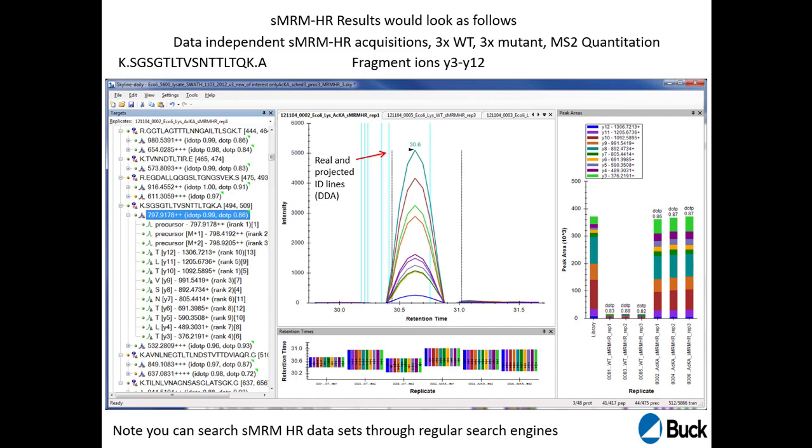It's really easy. It's incredible. Once you just have to install Skyline on the computer of the instrument. I don't know how this is at your place, but at our place we only have the acquisition software installed on the instrument. And because it needs to read in the method, they need to synchronize. But yeah, then you can just go, and maybe one day you import 40 precursors, the next day 50 or more, all depending on the questions for that part.